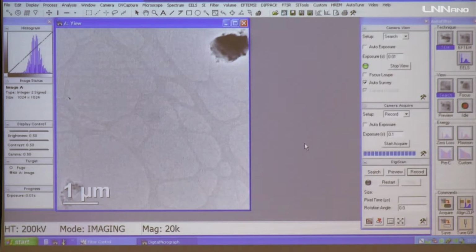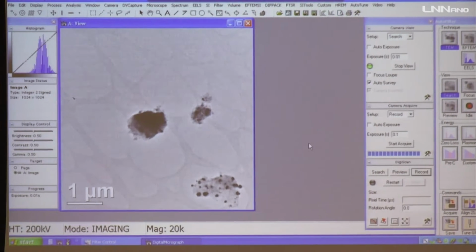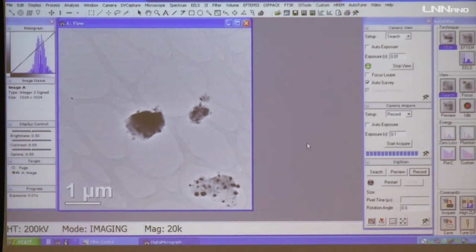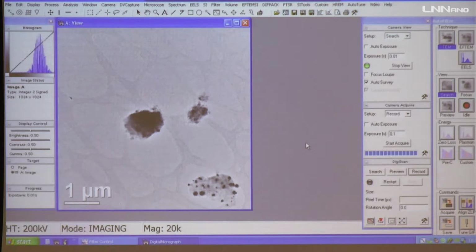Yes. The microscope is previously aligned in conventional TEM mode, and then I will just change the configuration for STEM mode. As I said, it is computer controlled. It's very easy to do. It's just to push the button and it will be in another configuration. For sure, you need to align it again. I left the machine previously aligned. I guess we will not have a problem with it, but it's not that complicated.